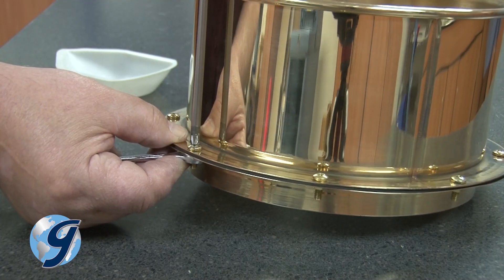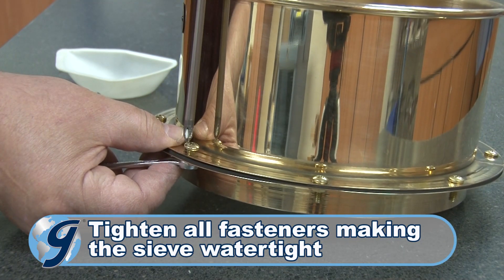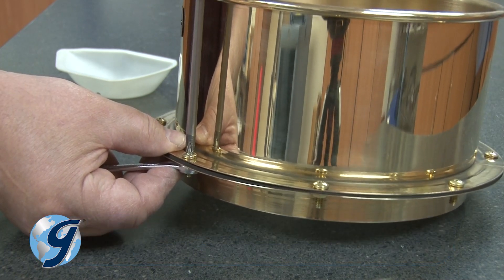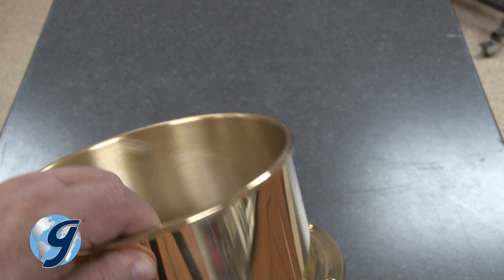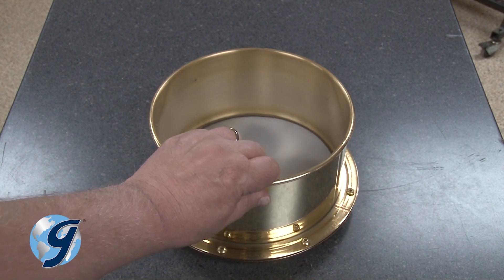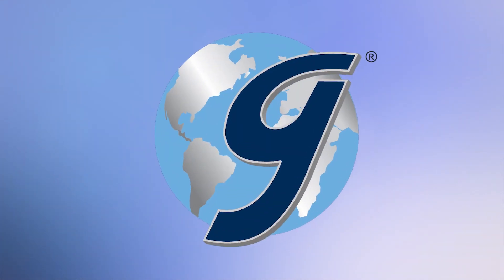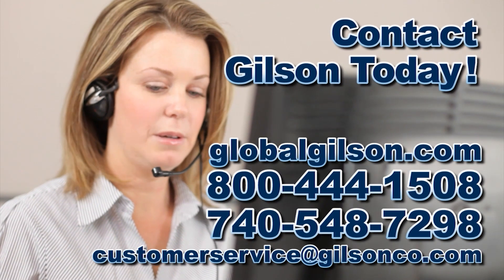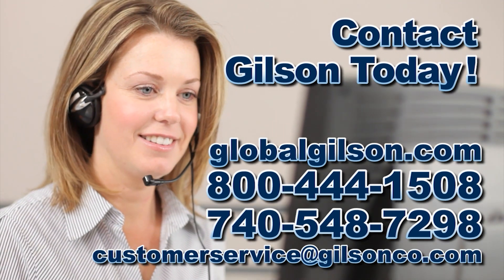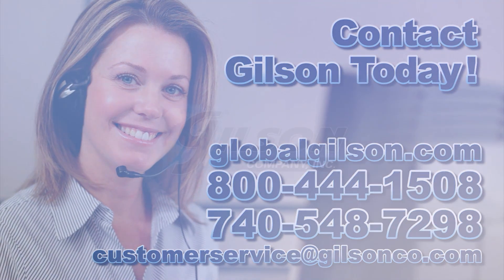Once completed, tighten all fasteners just enough to make the top and bottom section of the sieve watertight. Now your replaceable mesh wet wash sieve is ready for your next testing application. For any questions about replacing the mesh cartridge on a replaceable mesh wet wash sieve, or for any Gilson product, please contact Gilson customer service or technical support.